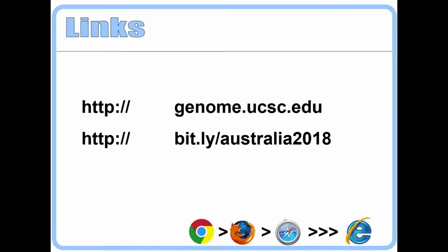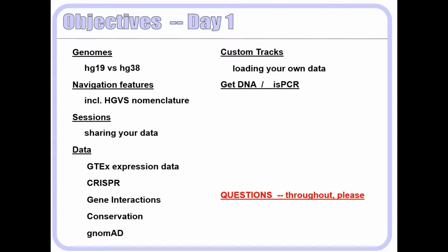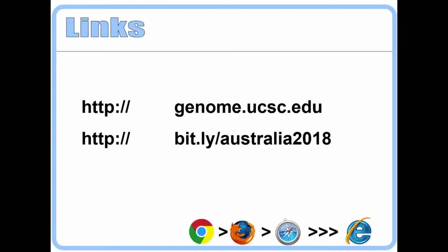So here are some links that'll be useful today. The top link is the Genome browser itself. The bottom link is a page that has some content that I'll be referring to from time to time through today's presentation. So I encourage you, I'll leave it on the screen for a second, to open up a second window or tab on your browser. I encourage you to have both of these active, so you can follow along in real time as I go.